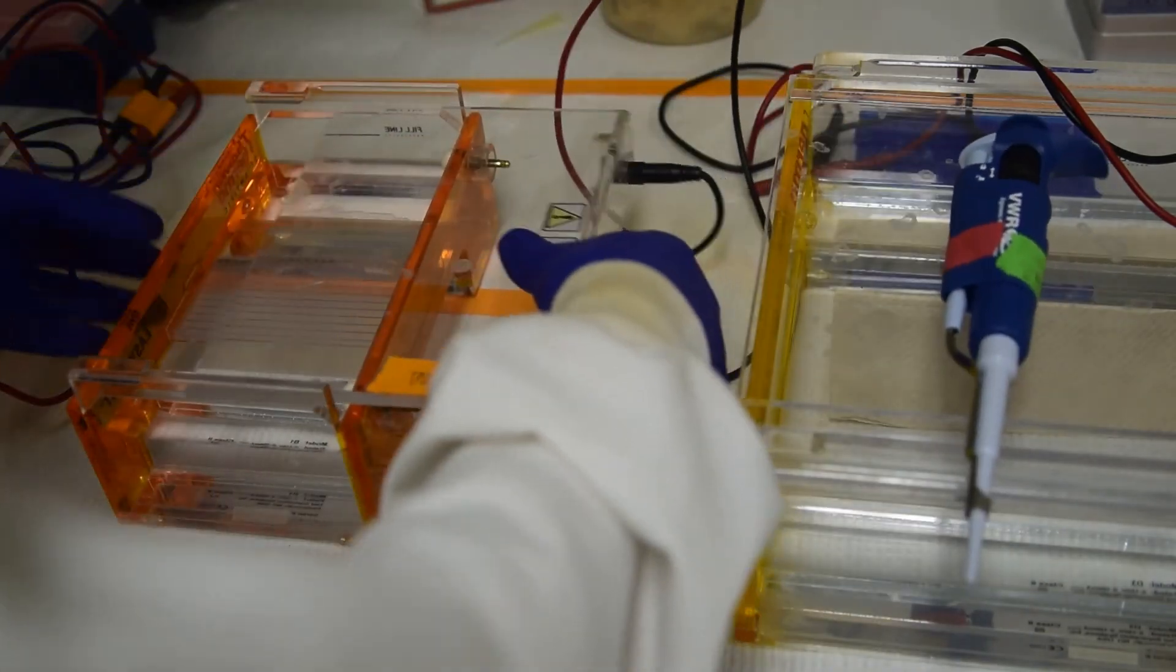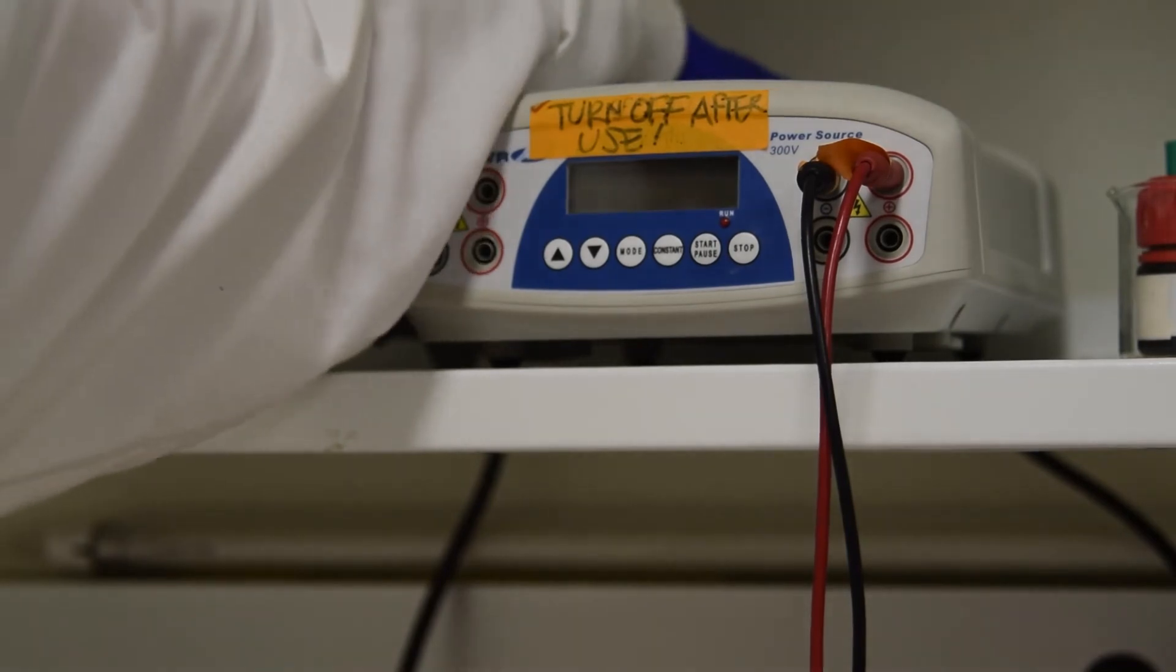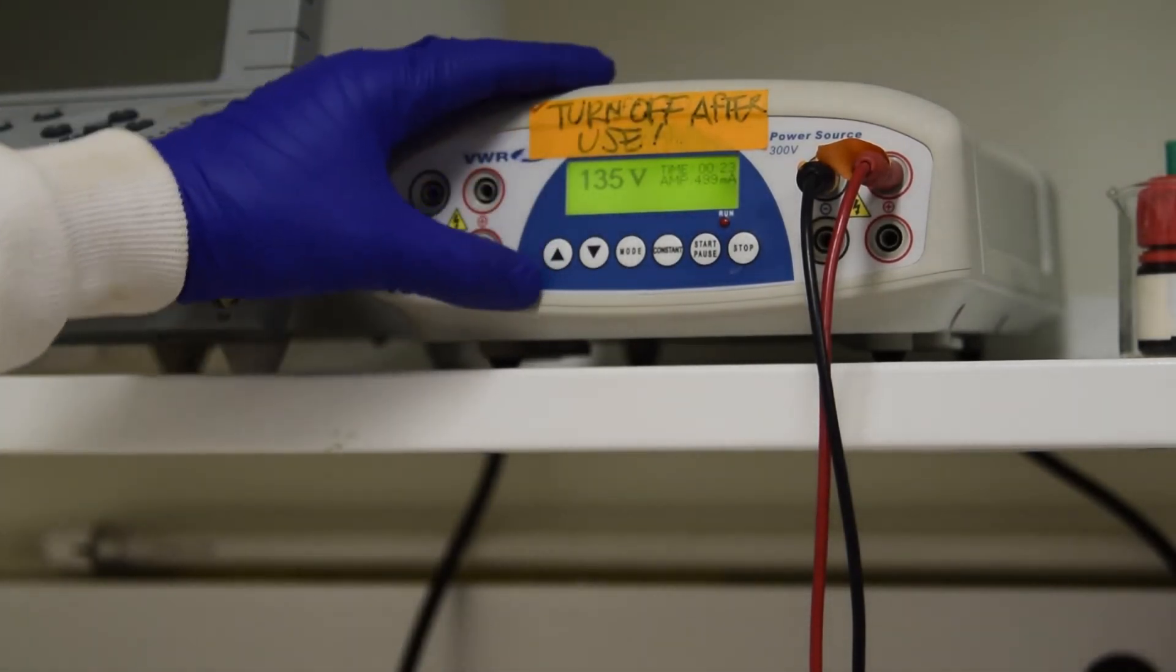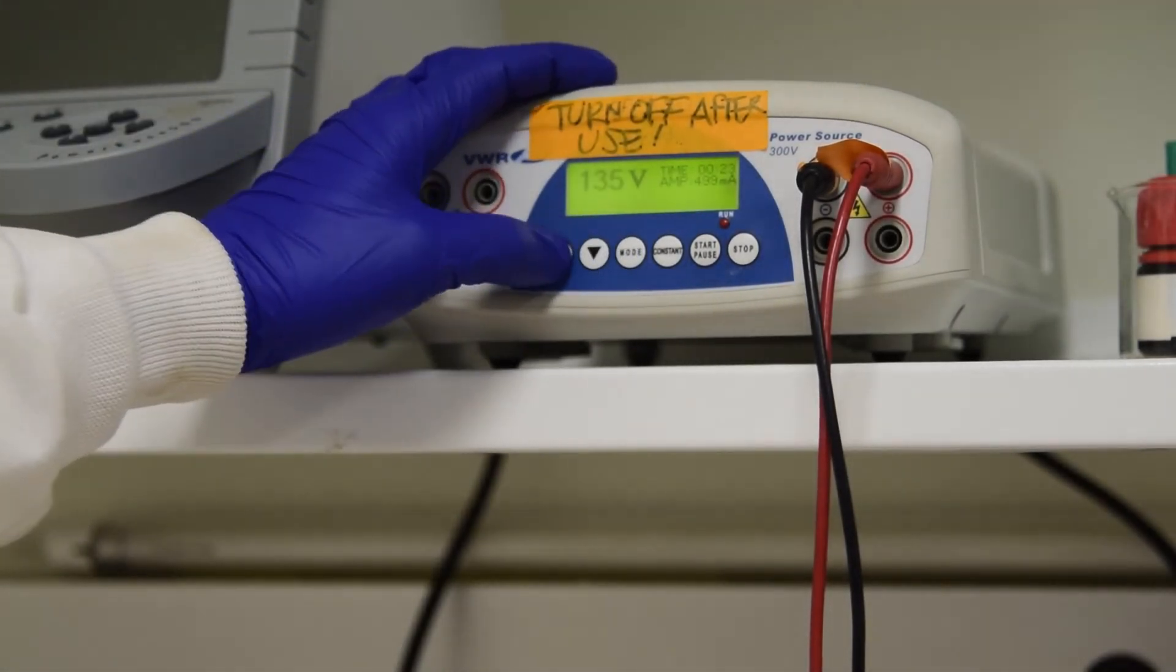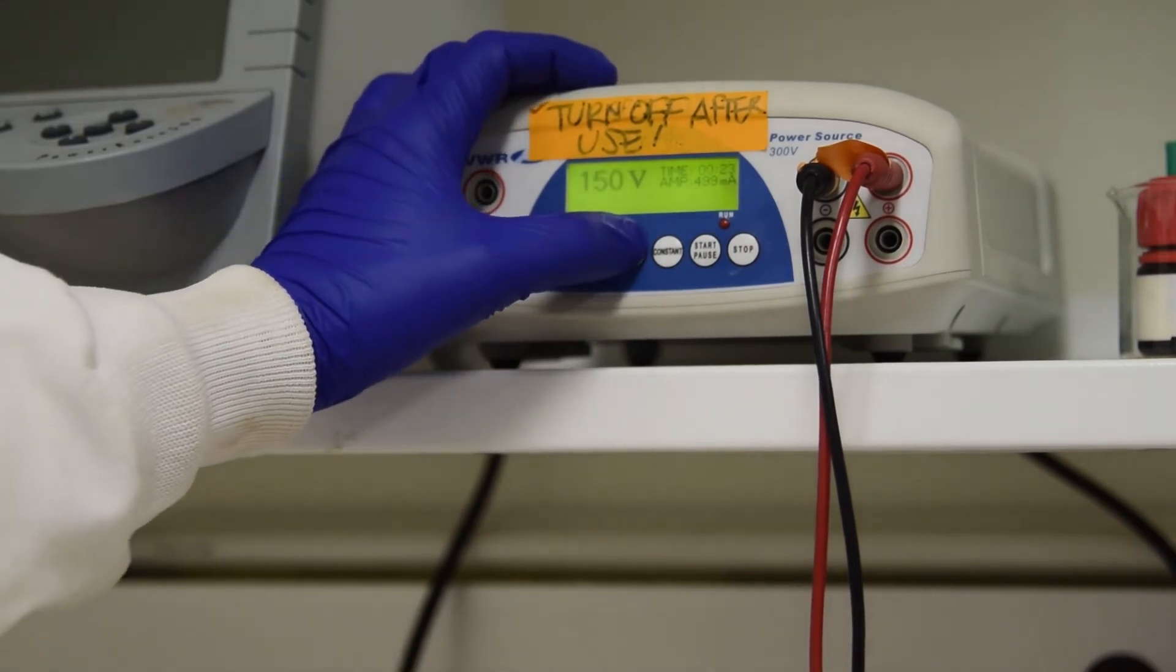Close the gel box and set to your desired voltage and time. 150 volts for 9 minutes works well for 1.5 kilobase amplicons.